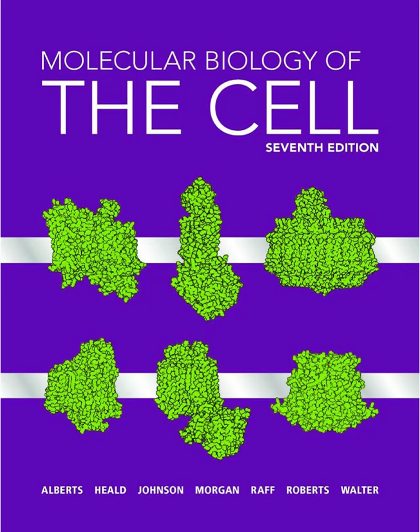First up was SIM, structured illumination microscopy. Right. SIM is one approach, typically getting down to about 100 nanometer resolution. It works by illuminating the sample not with uniform light, but with a striped or grid pattern of light. Okay, patterned light. Why? This known pattern interacts with the unknown fine details of the sample, creating interference patterns called moire fringes. These fringes are larger than the original fine details, large enough to be resolved by the microscope.